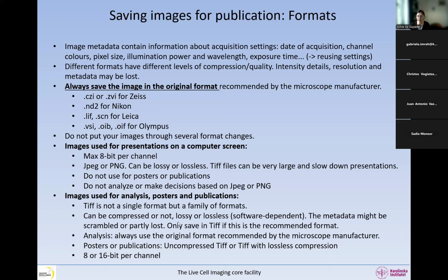TIFF can be compressed or not. It can be lossy or lossless. So it depends on the software you're using, and the metadata might be scrambled or lost partly. So do not think that because you save in TIFF, you're safe. Unfortunately, that is not the case. So only save TIFF if this is the recommended format by the manufacturer, to make sure you have the correct metadata.